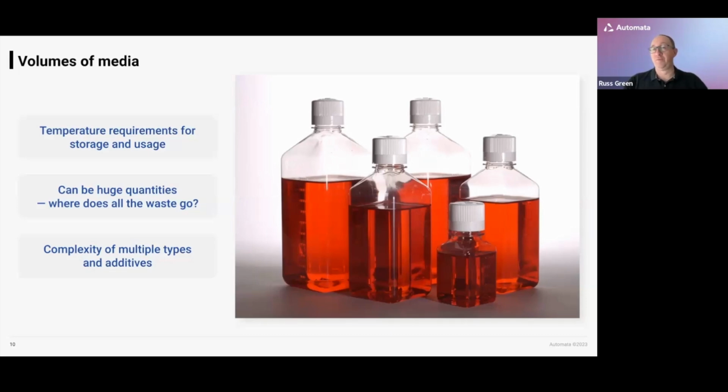There is a temperature requirement for storing that media, i.e. it's going to be cold, but then it's going to be warmed up just in time as we bring it to wherever we're going to utilize it, be it on the liquid handler or through some other device. And so we can't necessarily do it in the same way that we would do it manually, because we're not going to get out a bottle of media from a fridge and leave it on the side for a period of time and then put it away. We need something that can be used at a much larger scale than we would do manually.